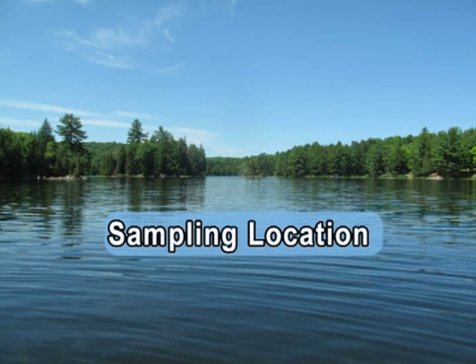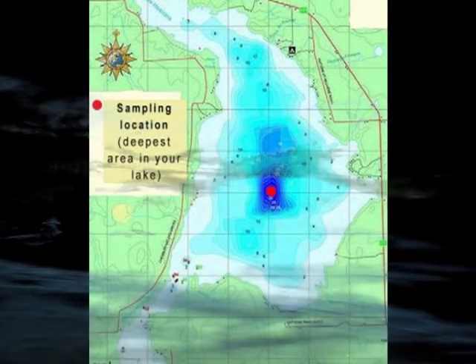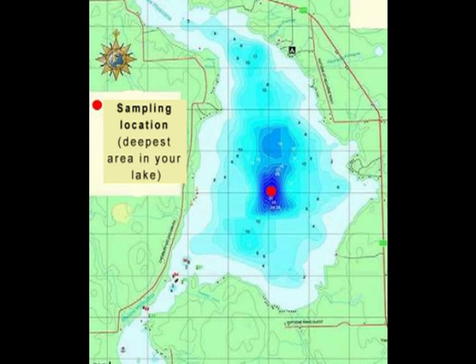Sampling location. Collecting a water sample for determining the lake water clarity and total phosphorus level of your lake is a simple procedure. It takes longer to explain than to do.